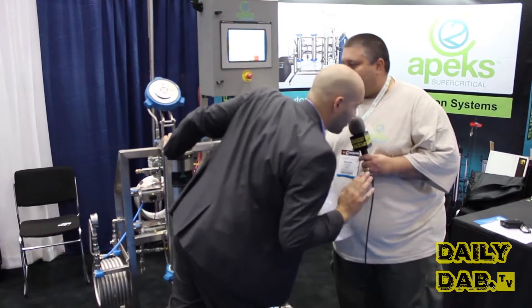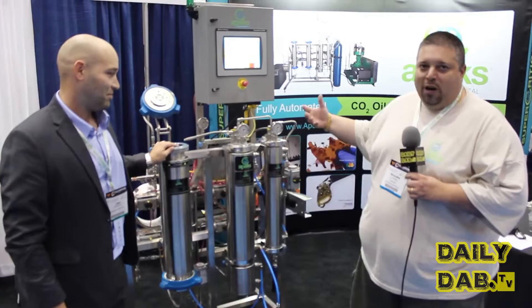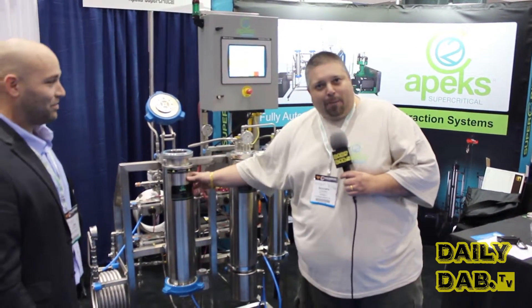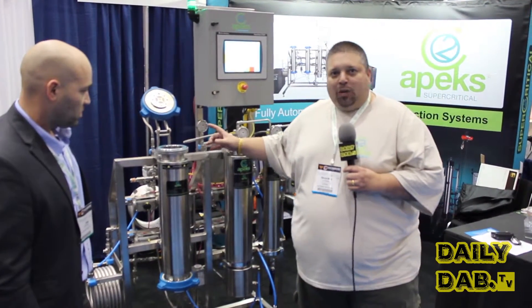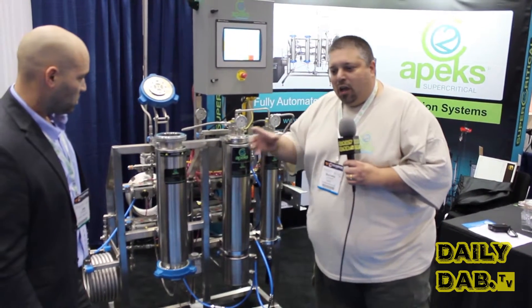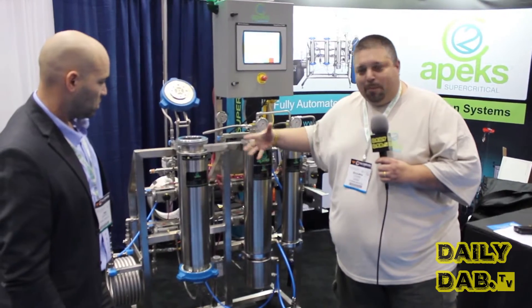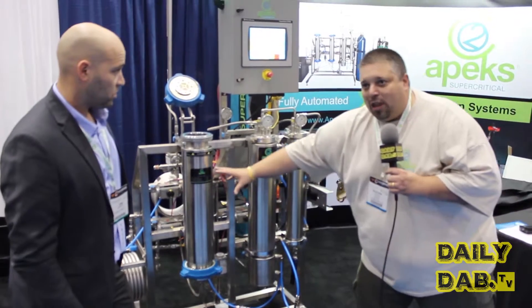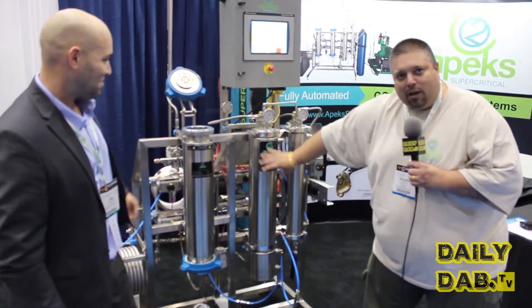You can make any type of extraction with it — that's correct. Dabs, shatter, whatever you want. What's happening is we're taking CO2 gas and under pressure we're converting it to a liquid. Imagine in your mind a glass of water — dropping a tea bag — the tea starts coming off, seeping. That's what's happening in here at 1200 PSI. And then imagine that water being taken away — that's what's happening over here on our separator side.